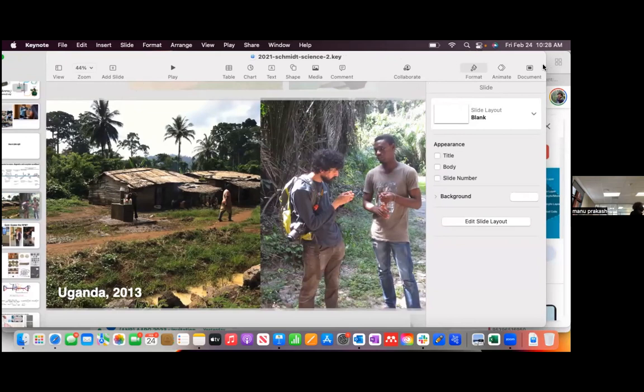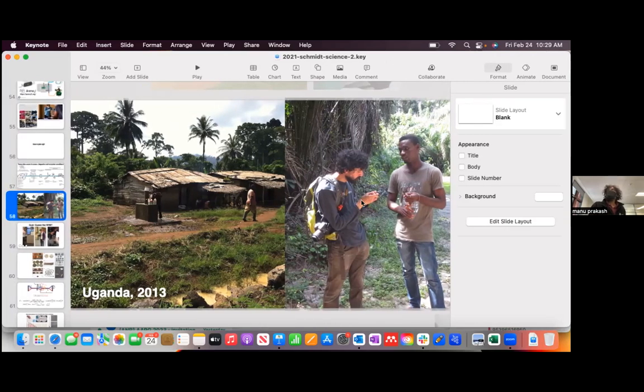That's the problem. And so when you're thinking a little bit about many sets of tests that require something like this, if you cannot do that first step, then you can't proceed, or you would wait for electricity. So I think the challenge that we started in 2013 was this notion of how do we tackle centrifugation in a primary healthcare center or just at home, even in places. We recently built a COVID test out of this idea.